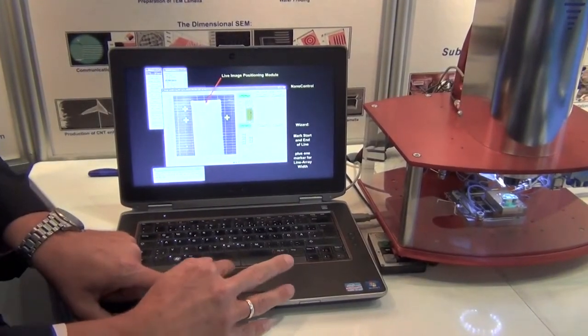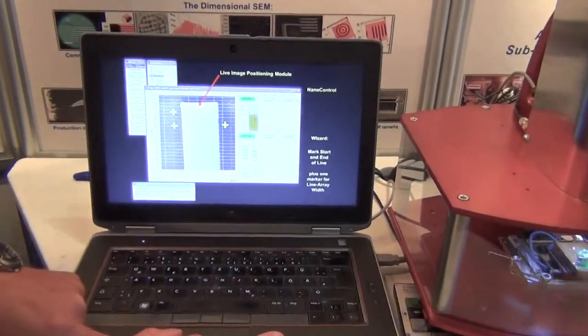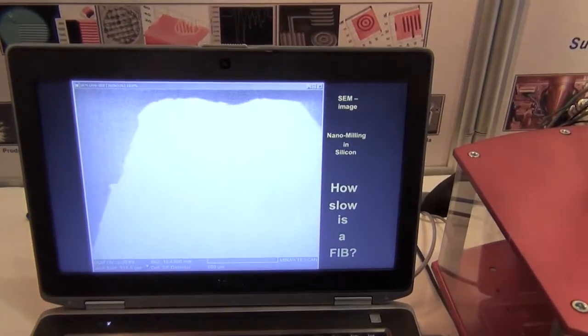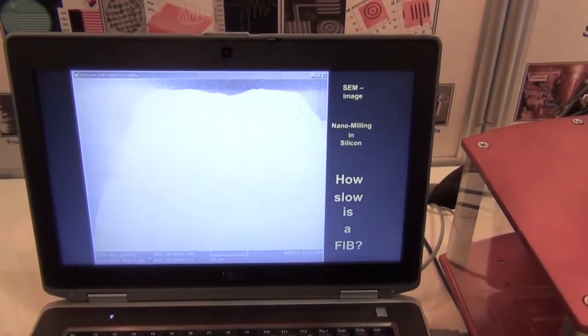So we selected three crosses with the mouse. And I say start here, okay. And the automatic process starts to cut a line, an area of lines.